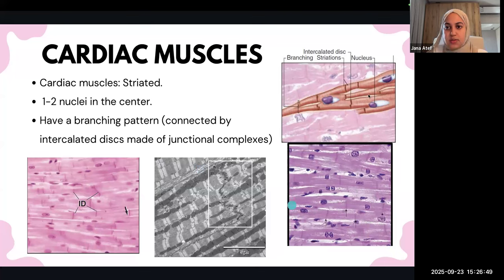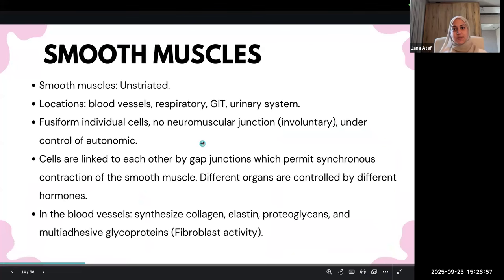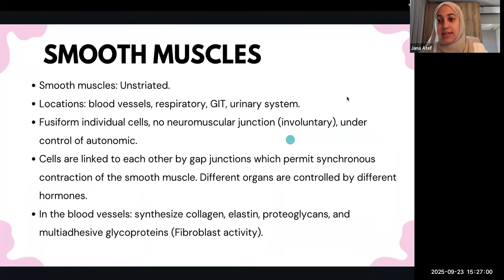Okay, so let's move on. This is all good for cardiac muscle. Like I said, you see this, guys, it's so easy, 3 points. This is cardiac muscle, okay? Perfect. Now the smooth muscles, okay? So like someone asked, do all muscles have A and I bands? No, the ones that don't are these ones, okay?